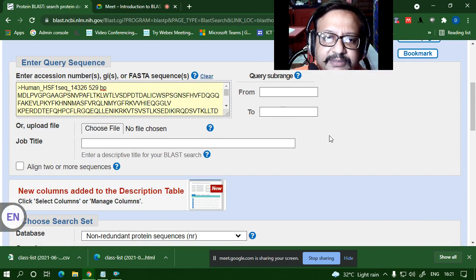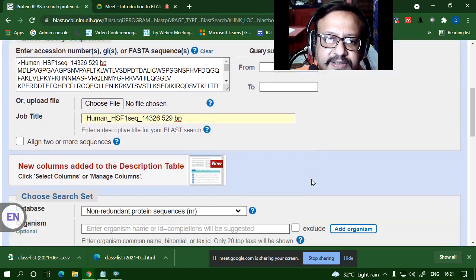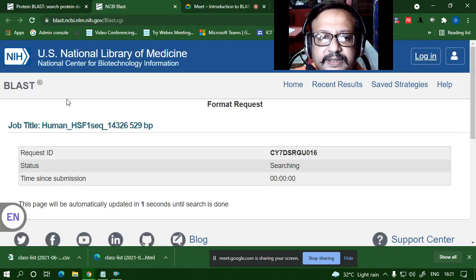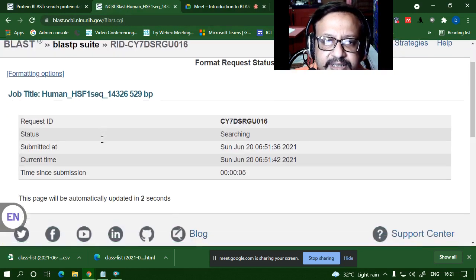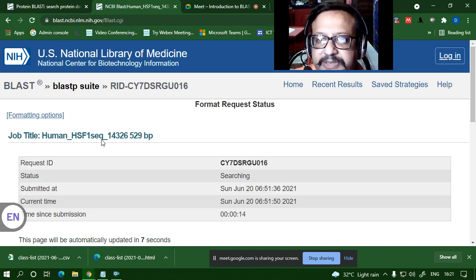The same thing I'm doing. I'm giving a job title, and I am pressing BLAST. A new window is opening. It is searching. This is the request ID, job title. Now America is awake, therefore it will take some time. When America is sleeping in the morning, it works much faster.